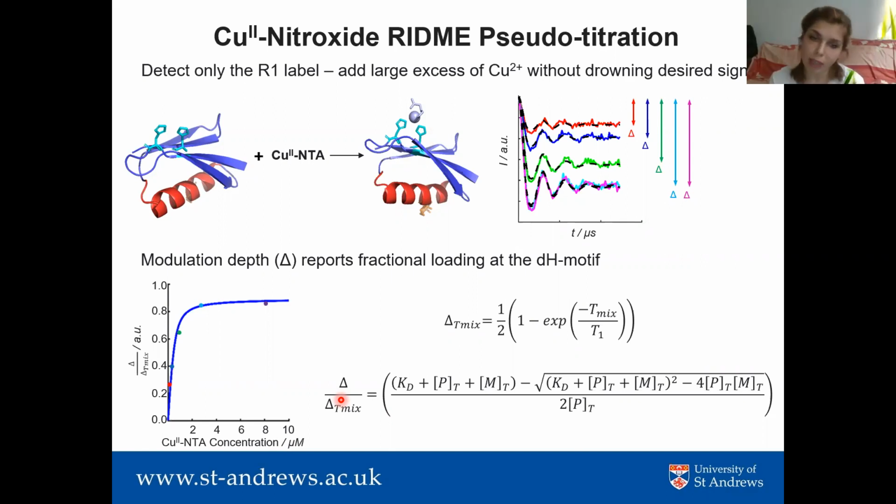Yeah. In this case, would it make sense to keep a constant mixing time, no matter what the T1 looks like for the different samples, even if the absolute value of the mixing time is not correct, so that you can say from one ratio to the other that you really see the species you want? Not for the copper nitroxide, for the copper-copper.